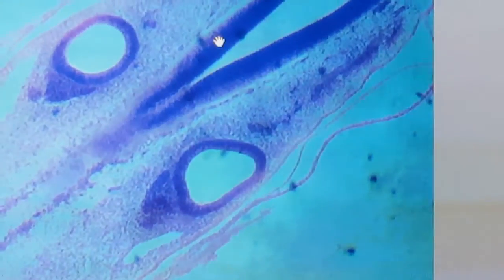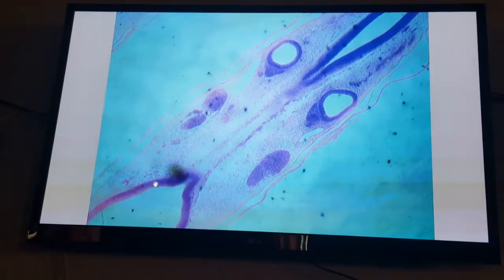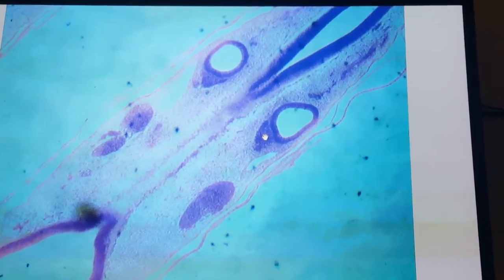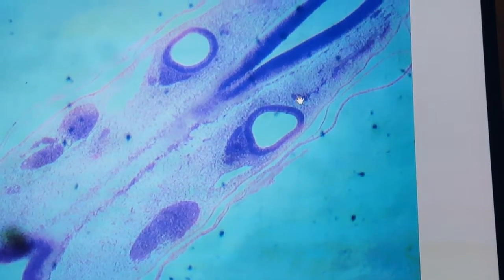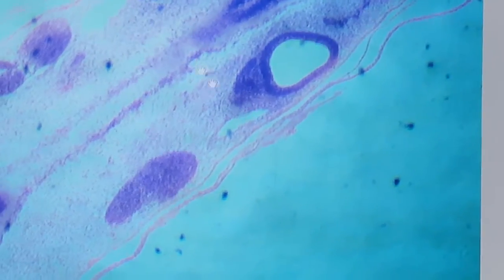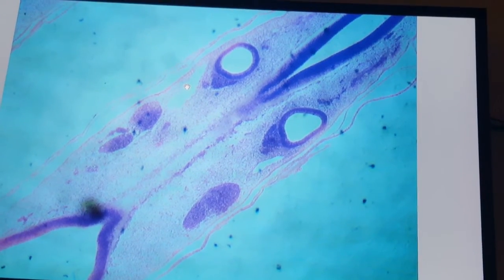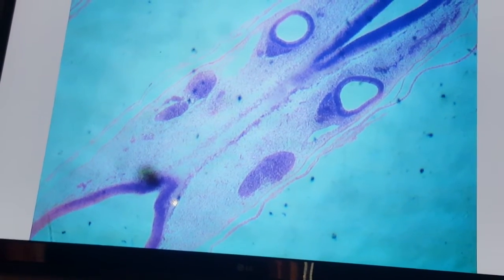So we have to look in this cephalic transverse section: myelencephalon, diagnosed by the thin roof; diencephalon, diagnosed by infundibulum; notochord; ear vesicle; anterior to it, ganglia of the 7 and 8 nerve, and anterior to that is the ganglia of the 5th cranial nerve. Behind the ear vesicle is the ganglia of the 9th and the ganglia of the 10th cranial nerve. Also, I can see cardinal vein on that side and that side, and because we are in the head region, this is the anterior cardinal vein. Don't forget that we have a neuroepithelium, mantle zone, and marginal zone.